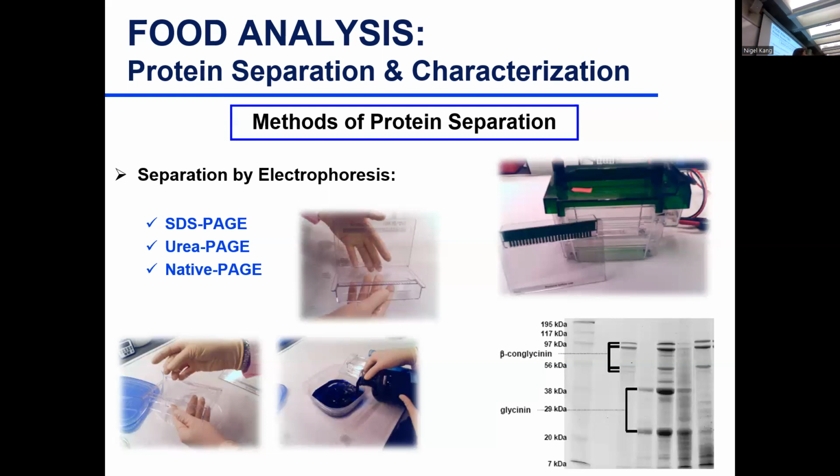For example, you know that for this protein sample, a 4 to 12% gel helps you to separate your proteins from each other. So that means a specific concentration of acrylamide. If it is like 12 to 16% or 18%, then you need a different concentration of acrylamide.